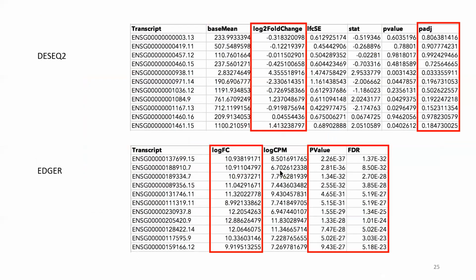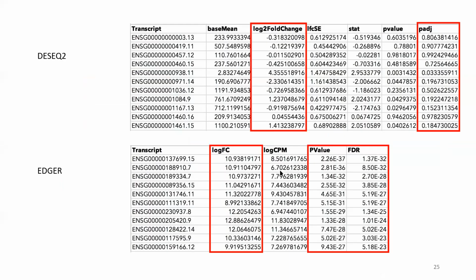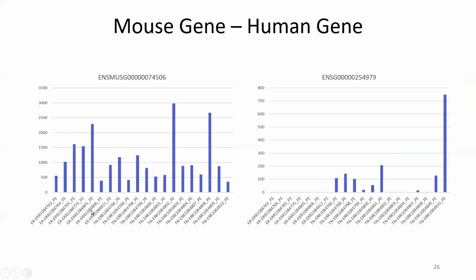Okay, so let's say we have used TNBCs. We have used basal-like cancer samples, and we have used Claudin-low cancer samples, and we try to look at how on the basis of the values we can separate them out and really try to understand what kind of information they give. So there are lots of levels of it. So this is the first level of analysis that you can do with the RNA-seq pipeline.